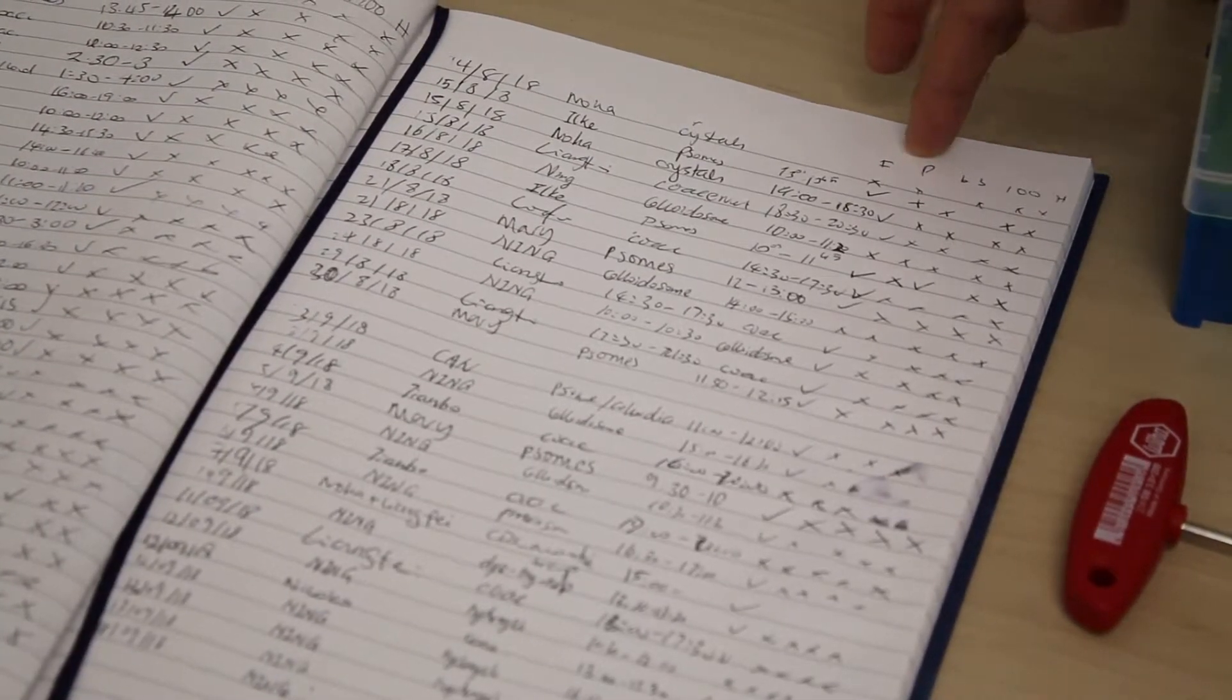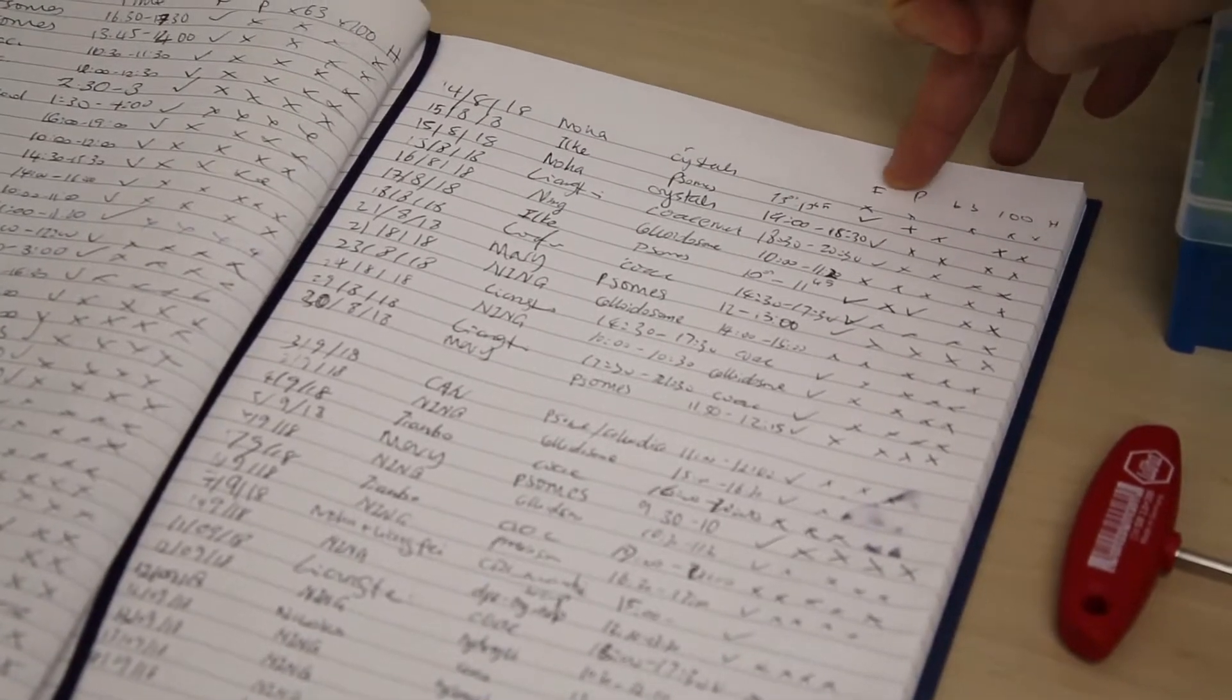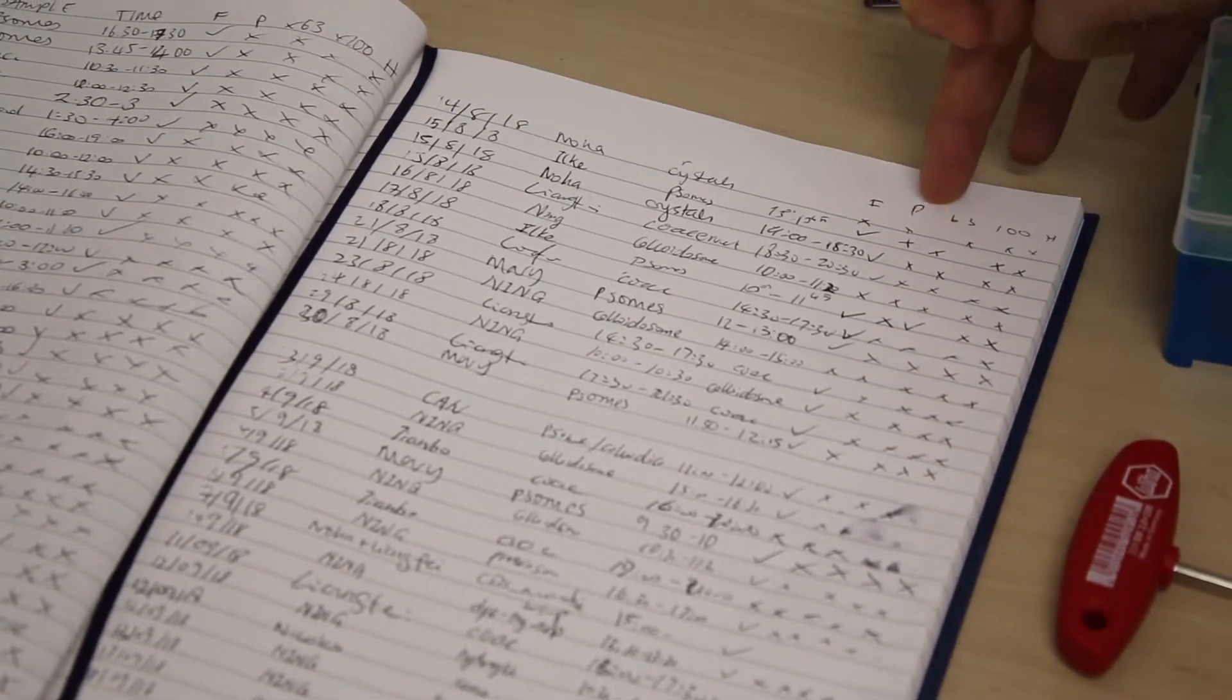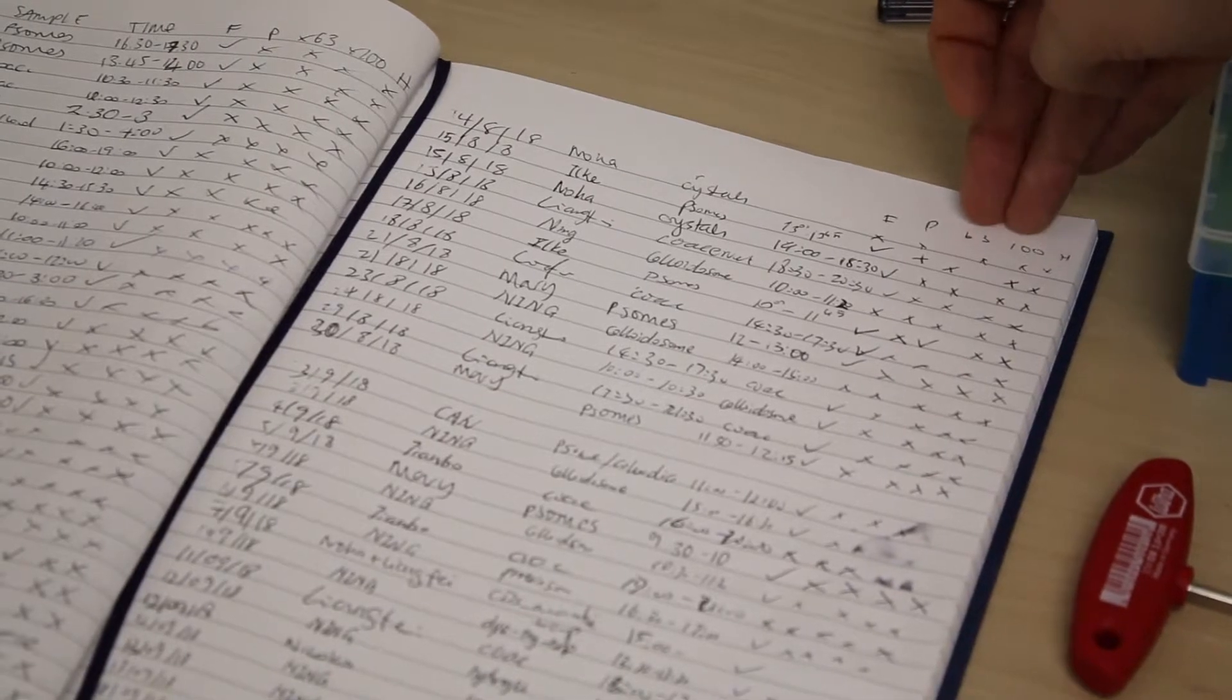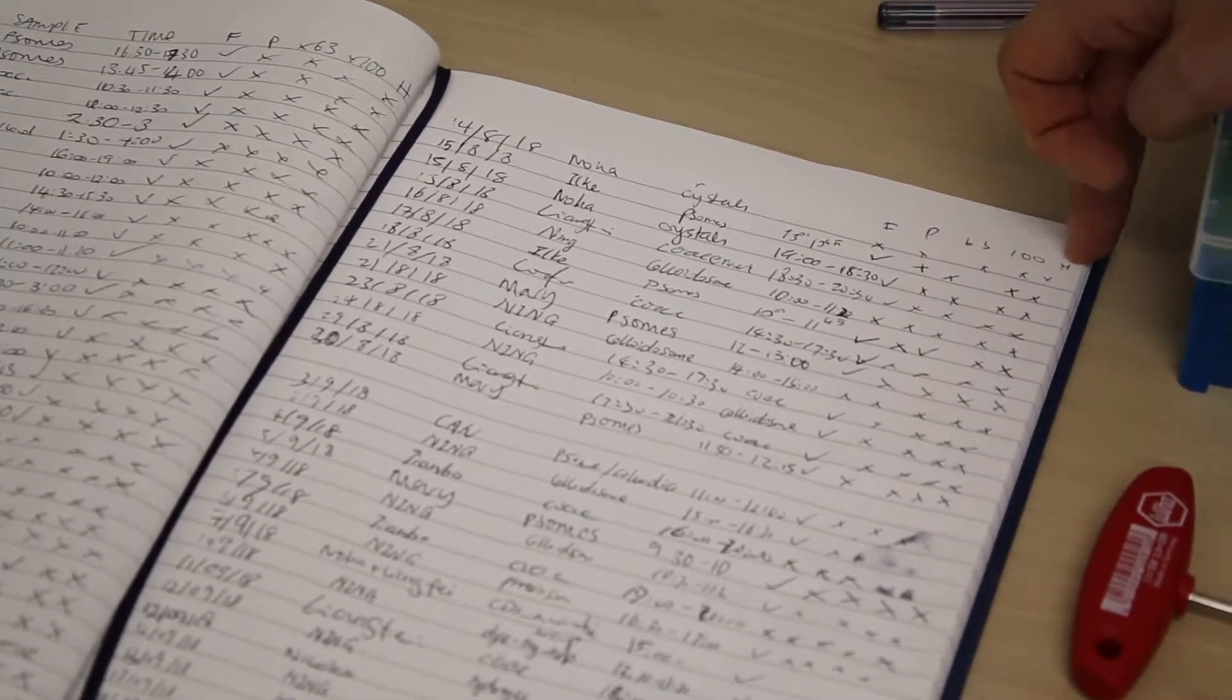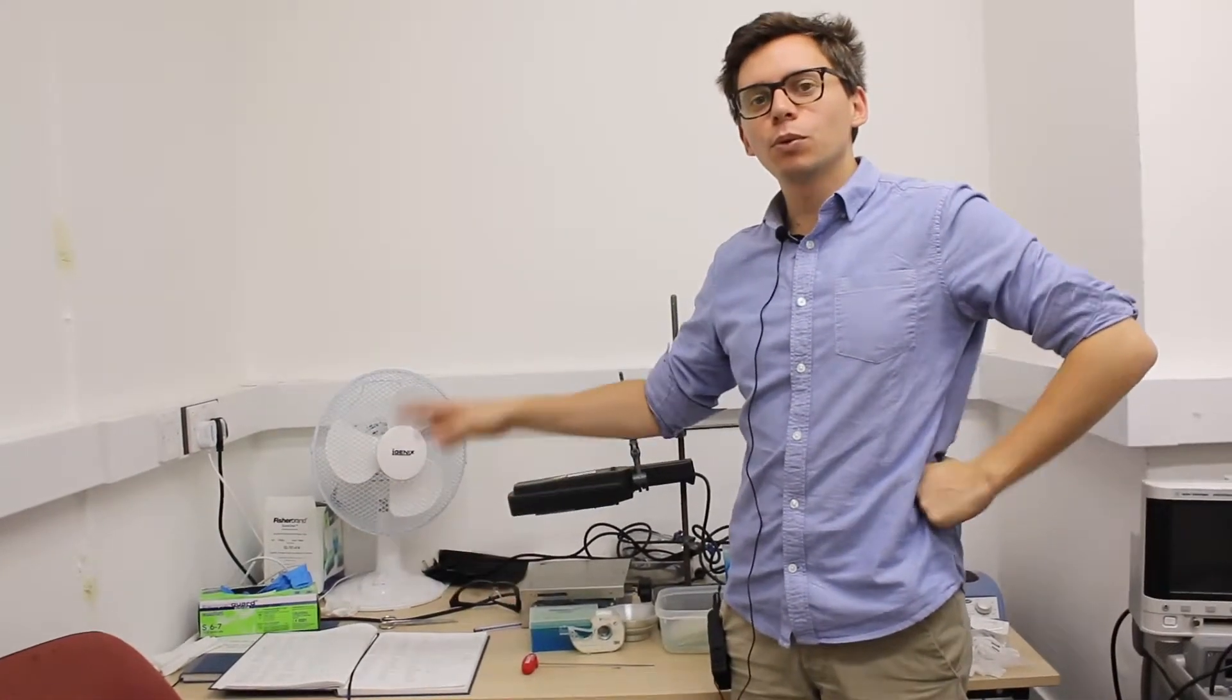And then there are 5 different things here that you should tick or not, depending on whether you've been using them. So F is for fluorescence, whether you've used fluorescence. P is for polarizer and analyzer, if you've used them. 63 and 100 are the two oil immersion objectives, so it's to know whether you've used this immersion objective. And H is for the heating stage, if you've been using the heating stage.